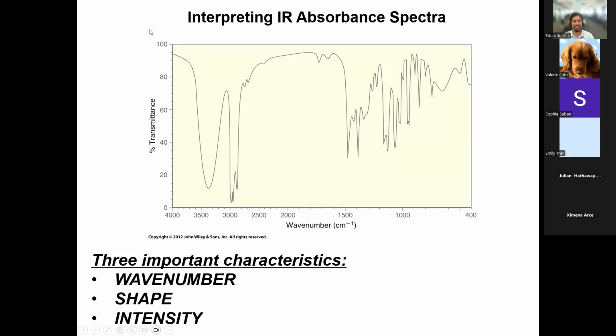All righty. Again, questions at any time, let me know. So now we get to the actual core of today's lecture, which is how do we make sense of this squiggly graph? We look at it and we just see a whole bunch of peaks. We see a whole bunch of lines. We see some numbers. What does this all mean?